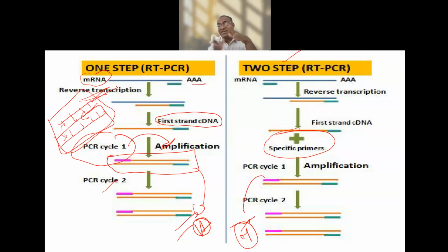So what we have read very beautifully is about the components of the PCR, what I am going to use. And then what do you mean by primer? What do you mean by a probe? How does it help in the synthesis of the nucleotide base pairs? What do you mean by amplification? Also, we have done it in a beautiful way. From the past 1 hour, we were able to explore the different types of PCR techniques, which we call two-step PCR and one-step PCR.